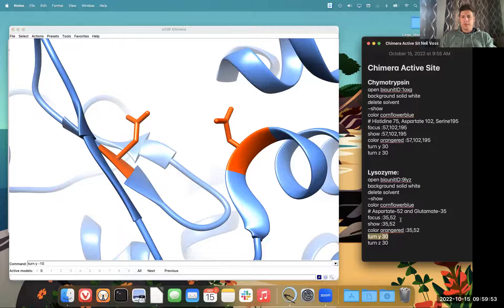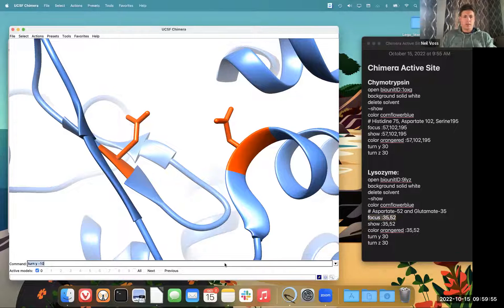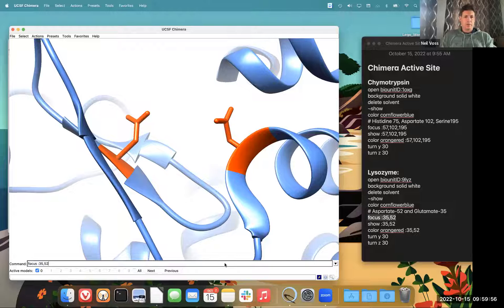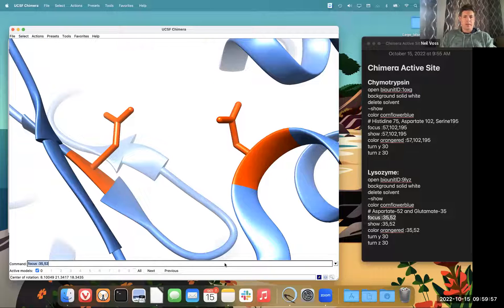So now I'm going to do focus again on our two amino acids. Now we're zoomed in on them.